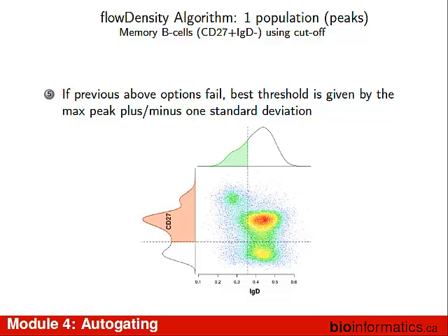I'm not going to say that I know everything about the biological underpinnings of this, but I've asked that question to a large group of doctors. I said, how do you set cutoffs without FMOs? And they say, well, we have internal positive controls and internal negative controls in that same bone marrow sample.